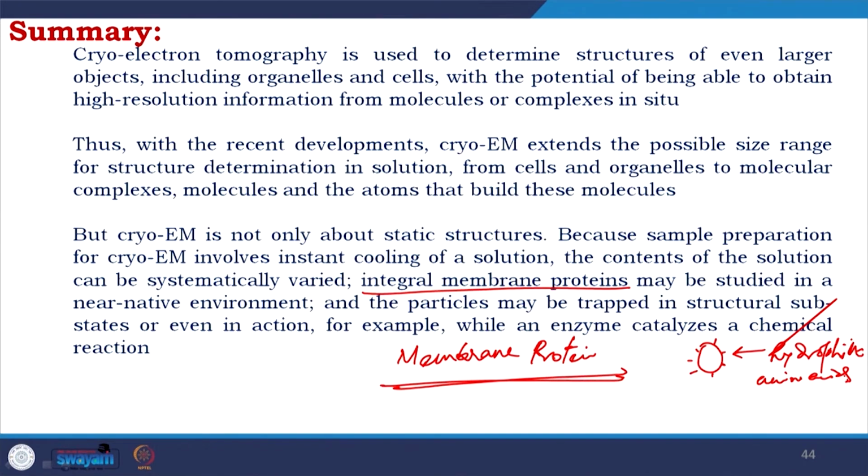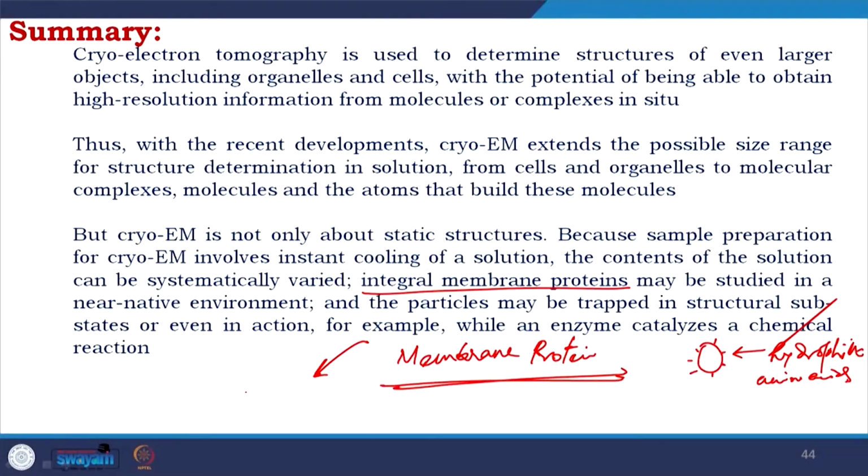For the membrane proteins, they have hydrophobic residues at the surface, so they could not be solubilized. So, to solubilize they need perfect condition, and that is why it is really very difficult to work in both crystallography and NMR, not here. You could directly get the membrane, freeze it and get the structure.